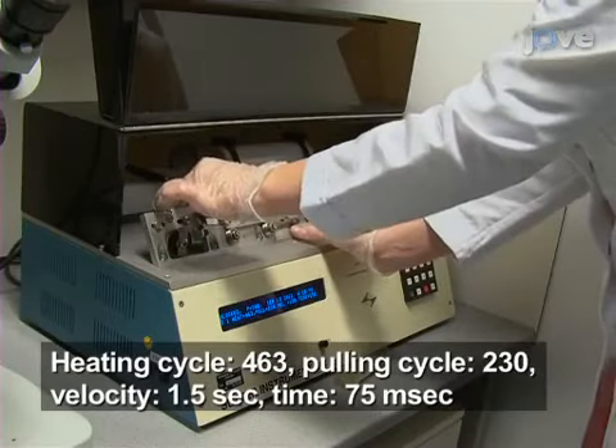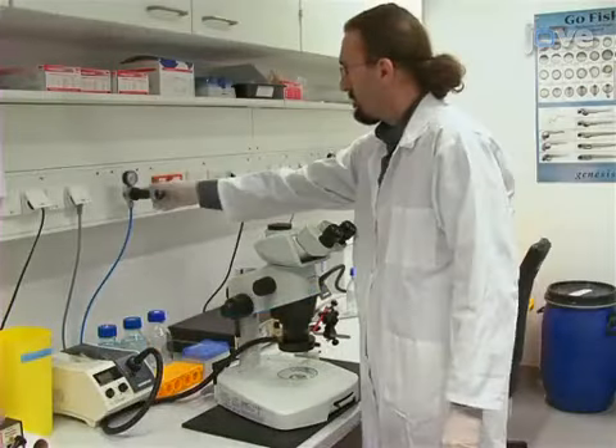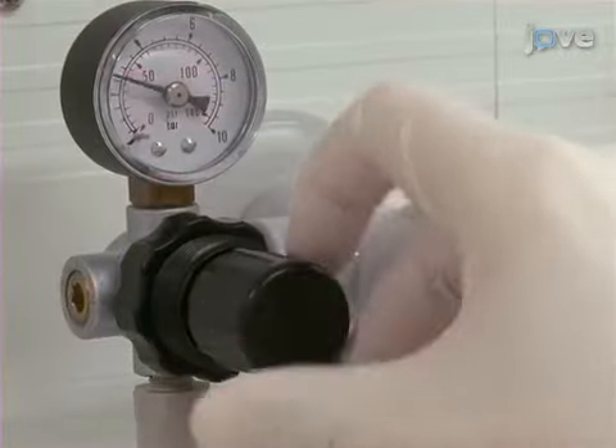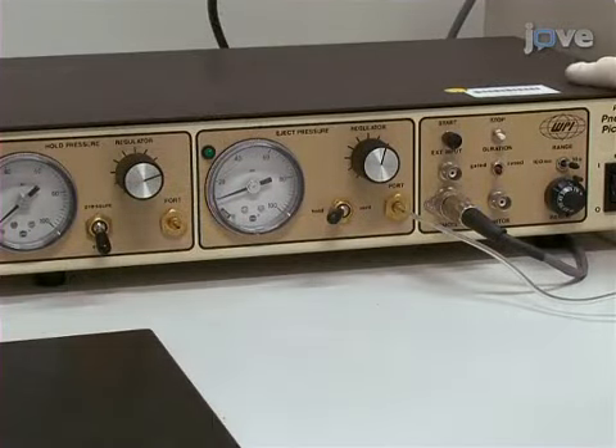Use a needle puller to prepare glass injection capillaries according to the following parameters. Turn on the pressure source and adjust the pressure settings to 50 psi or 3.5 bars. Adjust the microinjector settings as follows: hold pressure 20 psi.